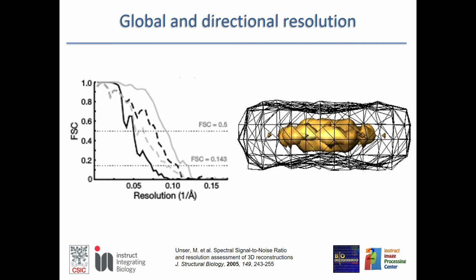And if they are related, that means that if we have, for instance, an uneven distribution of angles, let's say more top views of a particular structure, then in the corresponding plane in the 3D Fourier space we should have a better signal-to-noise ratio, because we have measured those coefficients more often, and then we can compute better averages.